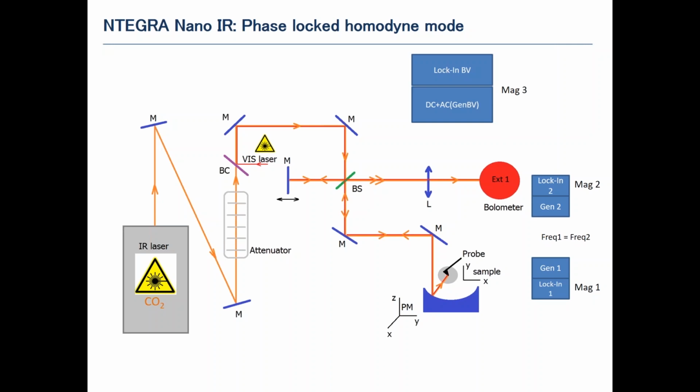As the result, without any need of a reference in the sample, or any need of additional adjustments of two-pass regimes, we can automatically get the contrast of optical amplitude and the optical phase of the backscattered light. And this is an example of how it works.